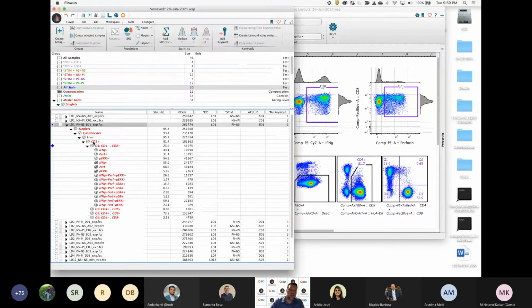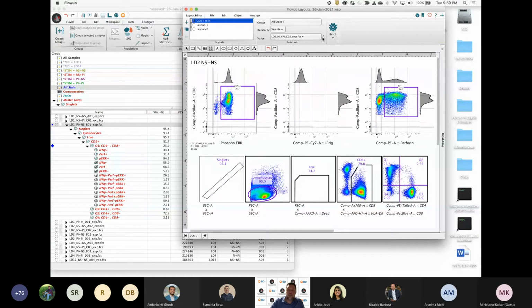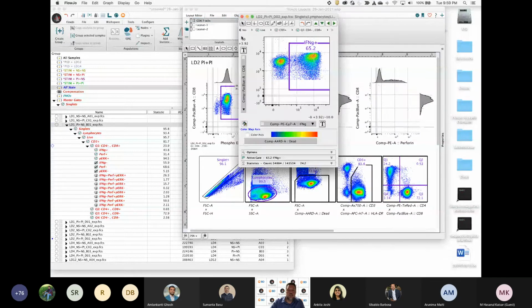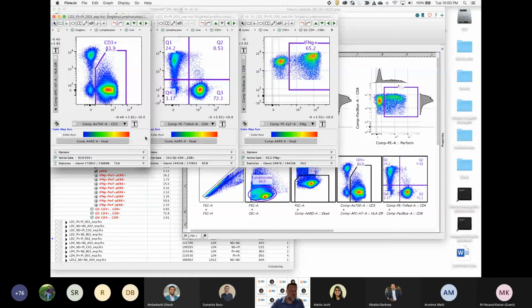Again, because we are synchronized, we don't have to go through and reapply that to other samples. I'm just making a change. And you can go through each sample like this, one at a time, to make changes if necessary. You're like, oh, let me go ahead and open that graph, make a change to the location of that gate. If I want to make a change to a gate that's upstream, I'll press this up button, get to the level that I want to, and make a modification of that gate, right?